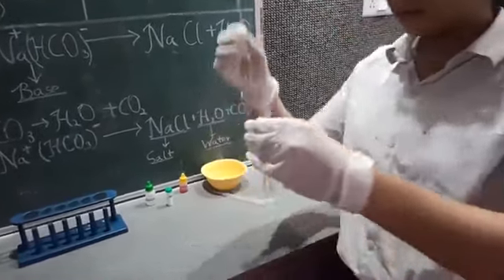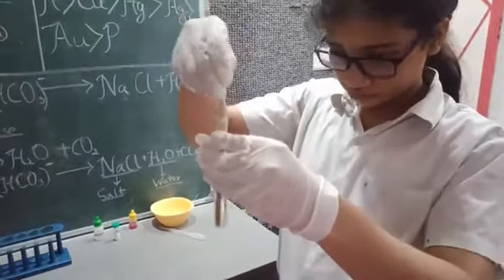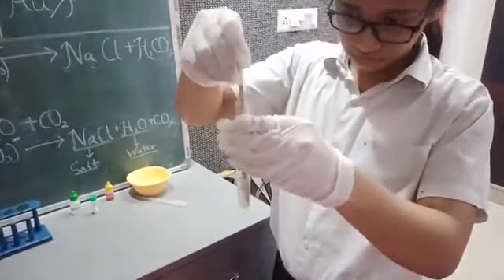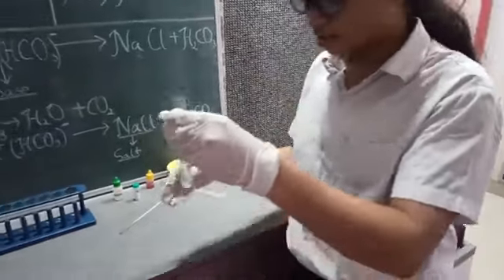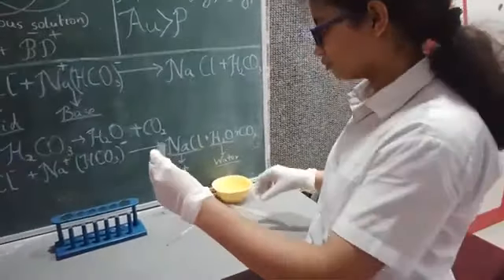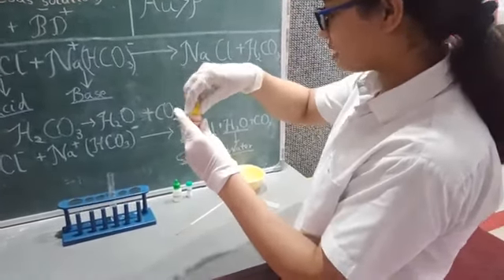Now I will start mixing the base so it mixes in properly. And right now, what you see in front of your eyes is a basic solution because sodium bicarbonate is a base. So, right now I will add 1 drop of methyl orange to this solution.